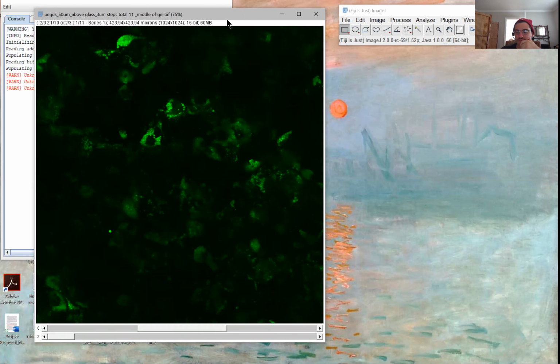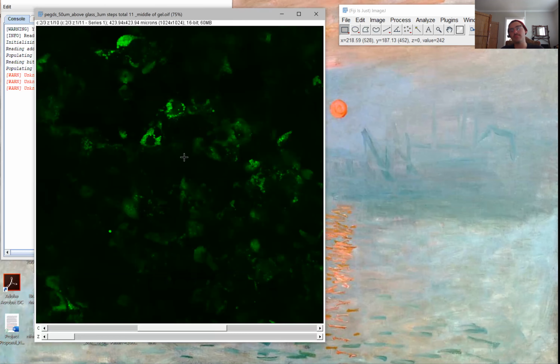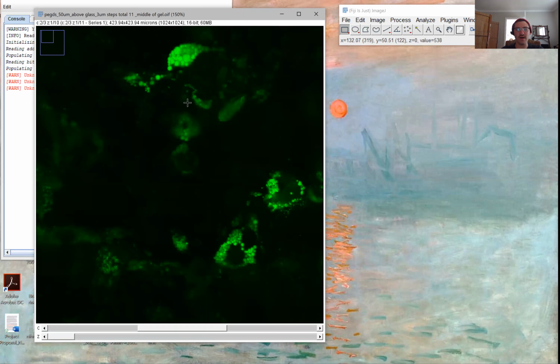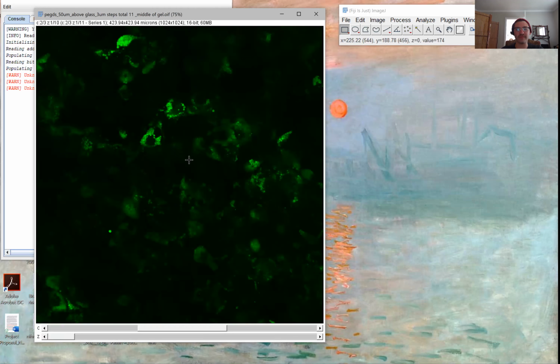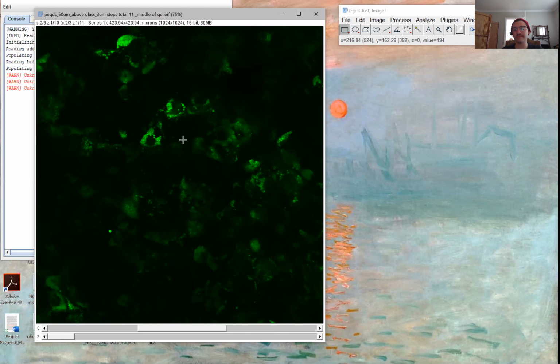And the last two or three things I'm going to show you how to do is zoom in. This is pretty simple. You can use the plus key or the minus key, but whenever you want to go somewhere specific on the image, you want to make sure that your cursor is over there and it will zoom in to that object. Or else it's just going to keep zooming in wherever the cursor is.